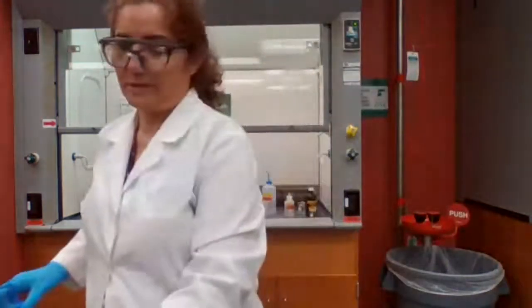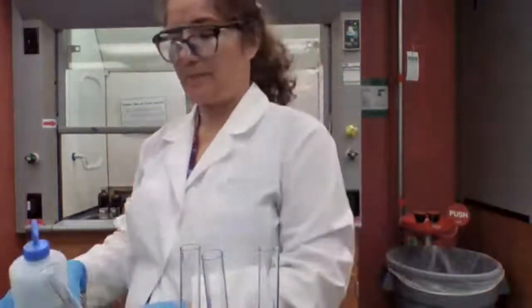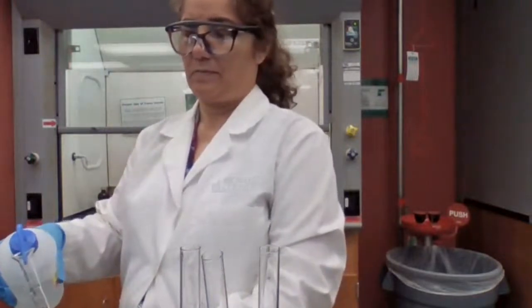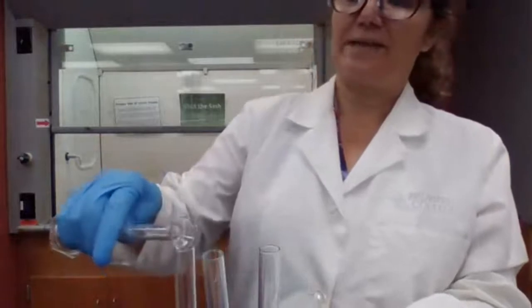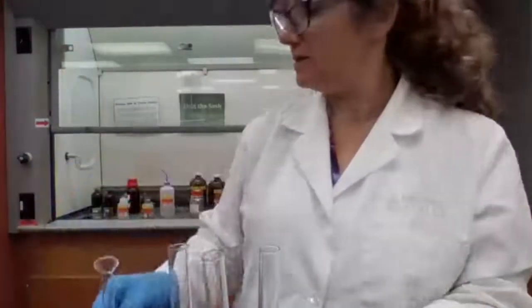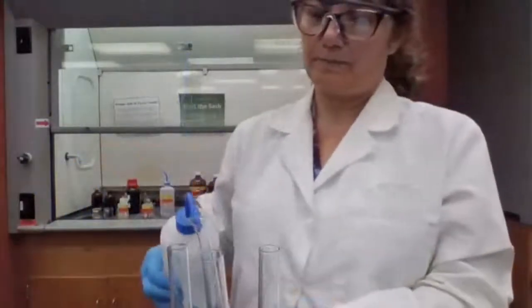Okay, for the Hinsberg test, what should I add? Help me with the Hinsberg test. What should I do first? I'm waiting. 5 milliliters of potassium hydroxide. So I'm going to add 5 milliliters of potassium hydroxide in each of the test tubes.